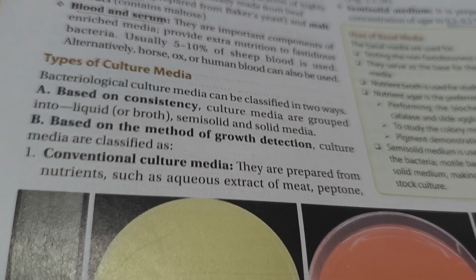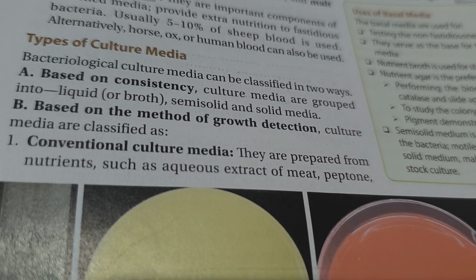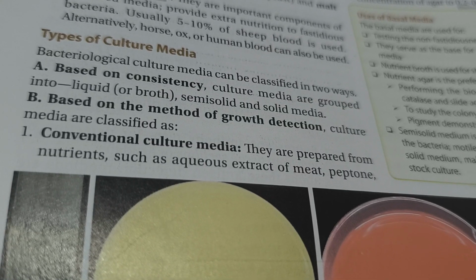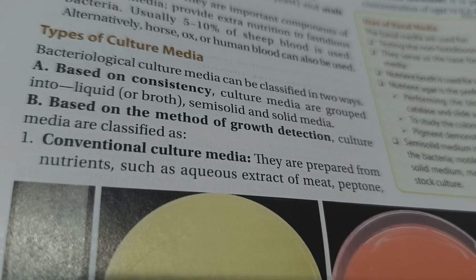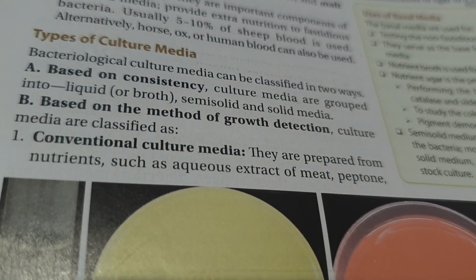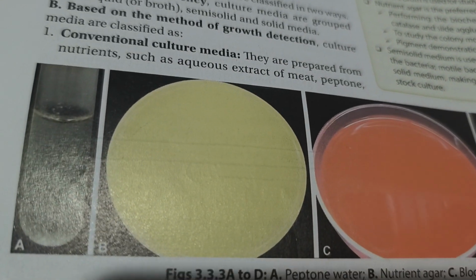Types of culture media. Bacteriological culture media can be classified in two ways. Based on consistency, culture media are grouped into solid media, semi-solid media and liquid or broth media. Based on the method of growth detection, culture media can be classified as conventional culture media.